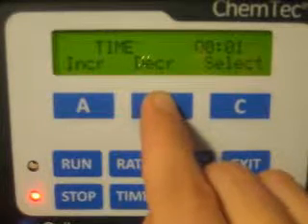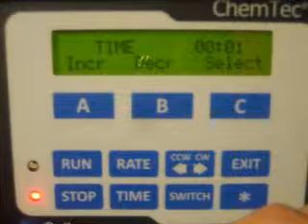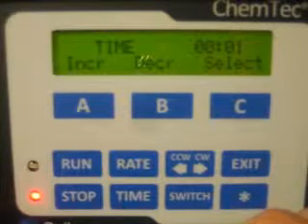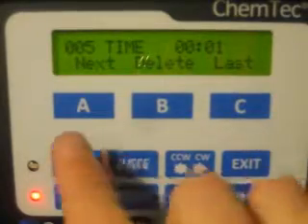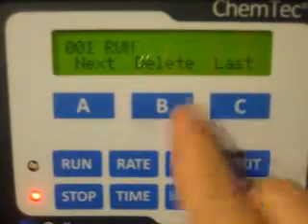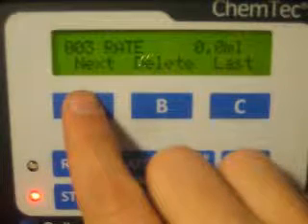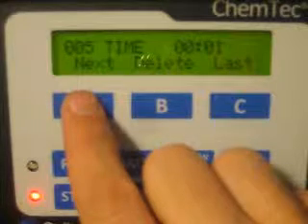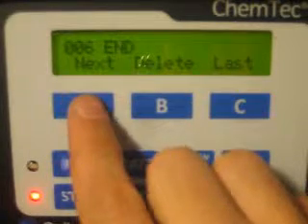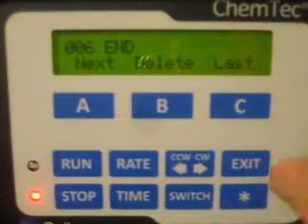And if you want longer time than that, you can also repeat these programs any number of times, so it can run all year if you wanted to. So 1 minute is our next time command. Now let's review our program. Run clockwise at 0 up to 532 for 1 minute and stop. Sounds simple enough. Let's try it out.